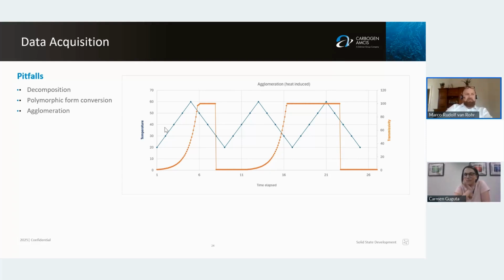That's glycine. We know the polymorphic form of glycine, the gamma form, in the presence of water and sodium chloride tends to form large agglomerates. The problem here is that the agglomerates turn so big that the laser, or the LED, doesn't really think that it is a slurry anymore. So it's just getting big chunks.